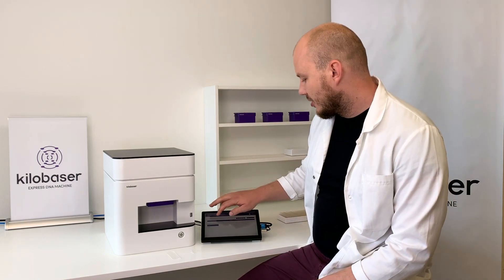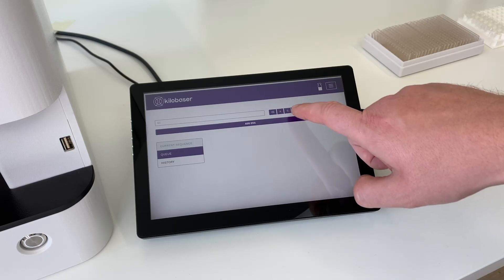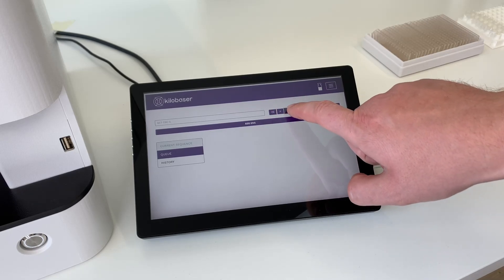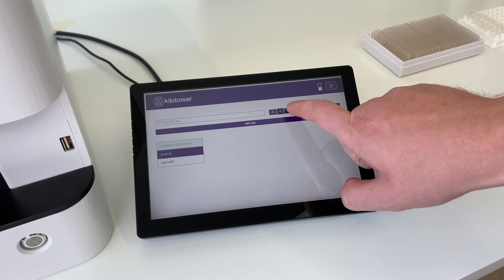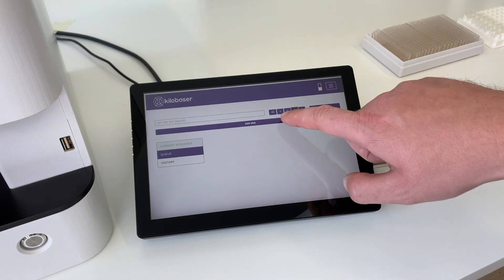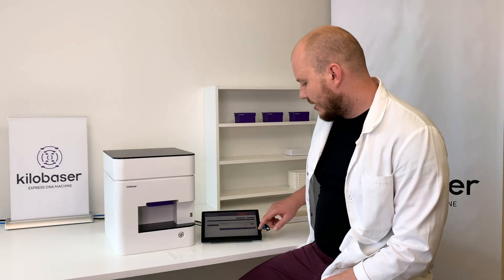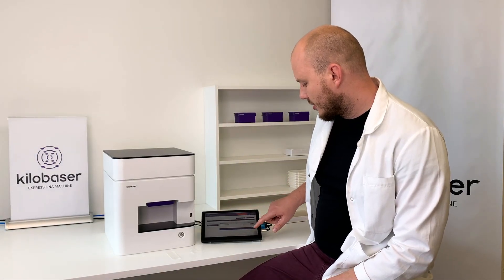Today I'm going to show you how easy it is to make your own DNA primers or oligos. All you have to do is just enter your desired DNA sequence here on the screen, press add DNA, then it shows some data and then you press start synthesis.